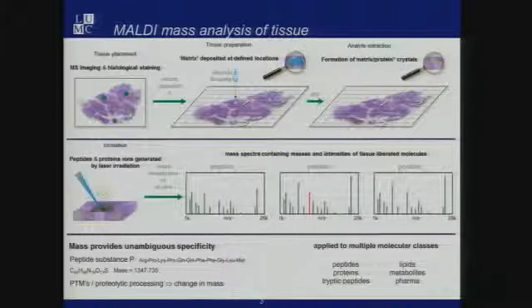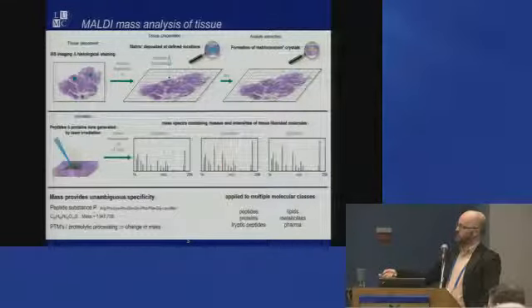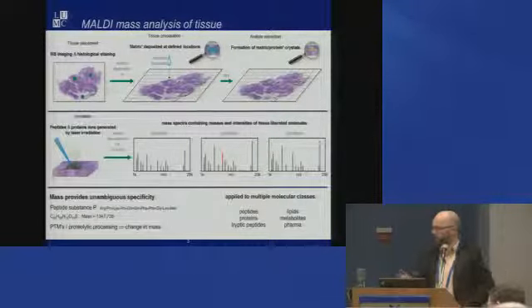What we can see here is, for example, position 2. We're missing the numbers, I do apologize. It has a unique signal attached to it, but it can also just be relative intensity changes between different positions. What's beautiful about imaging mass spectrometry is that the mass gives us a pretty high level of specificity. It's not quite unambiguous, that's just a little bit of exaggeration for the publication, but it gives us quite a high level of specificity. And the higher the mass resolution, or if we use SRM type techniques, or MS3 type techniques, or a little bit of ion mobility, we can increase that further.